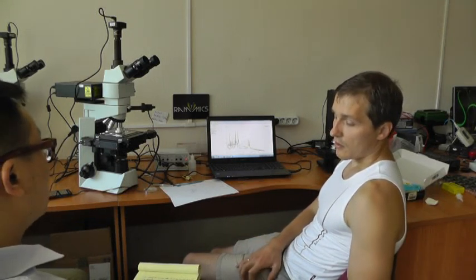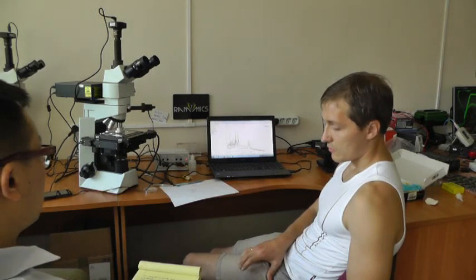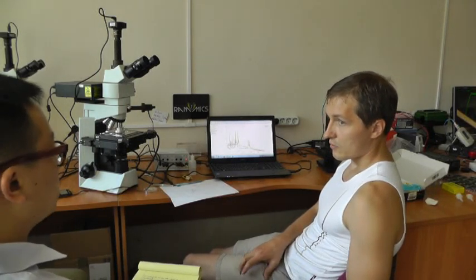The coverage of surface doesn't matter. Yeah, it doesn't matter, but I told you the step size should not be less than 10 microns, because otherwise you would measure the same particle several times. Yes, but the coverage of the powder may be limited.